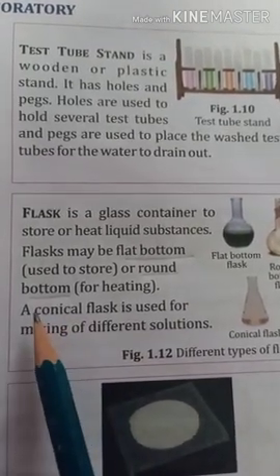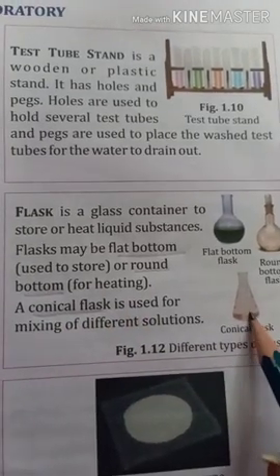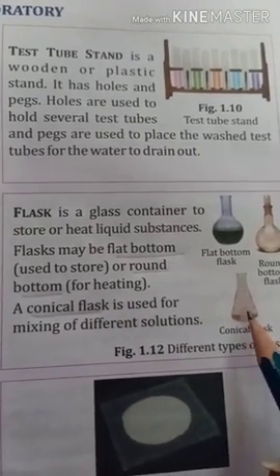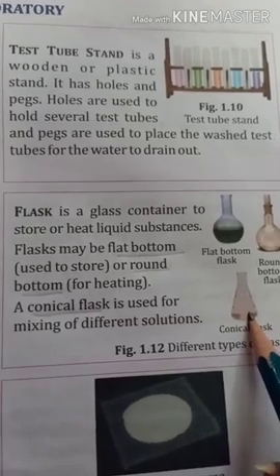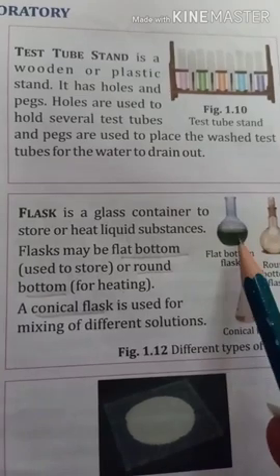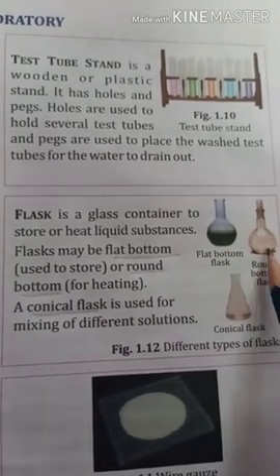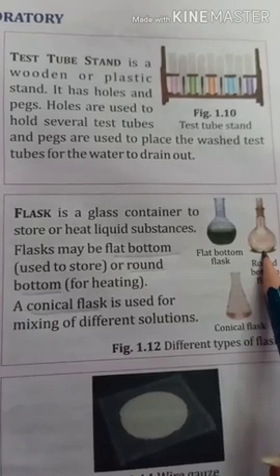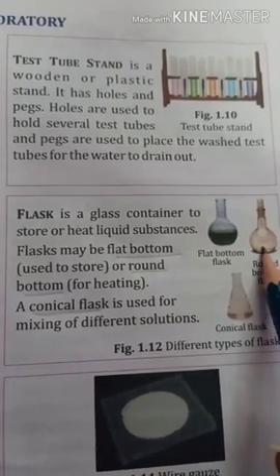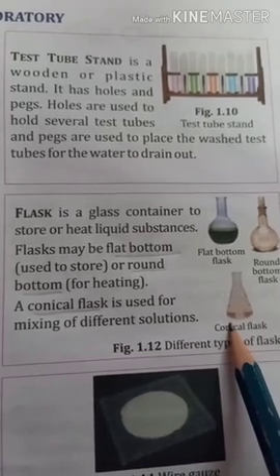Another type of flask we have is a conical flask. This flask is known as a conical flask and is used for mixing of different solutions. Conical flask is used for mixing different solutions.